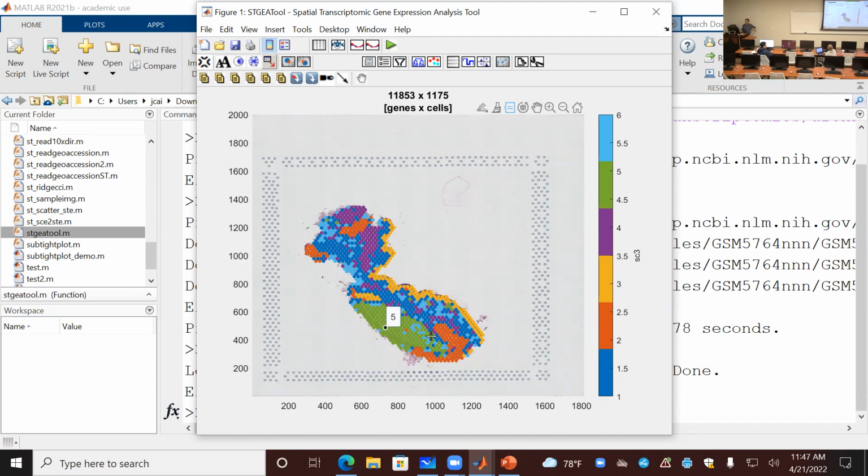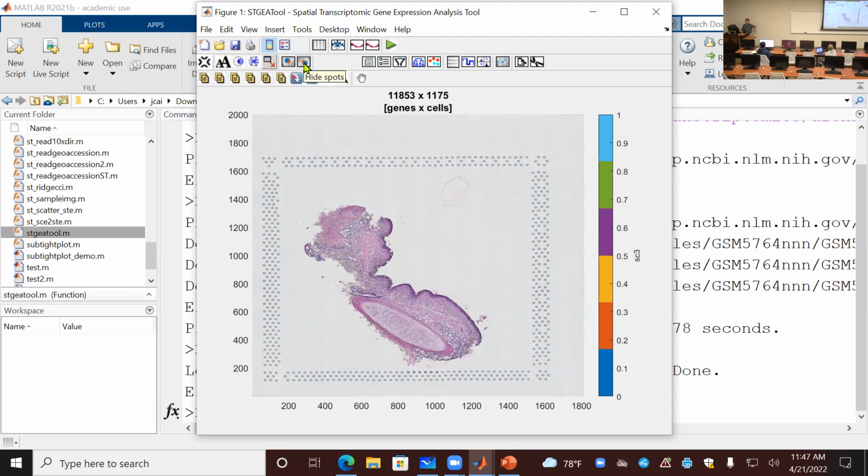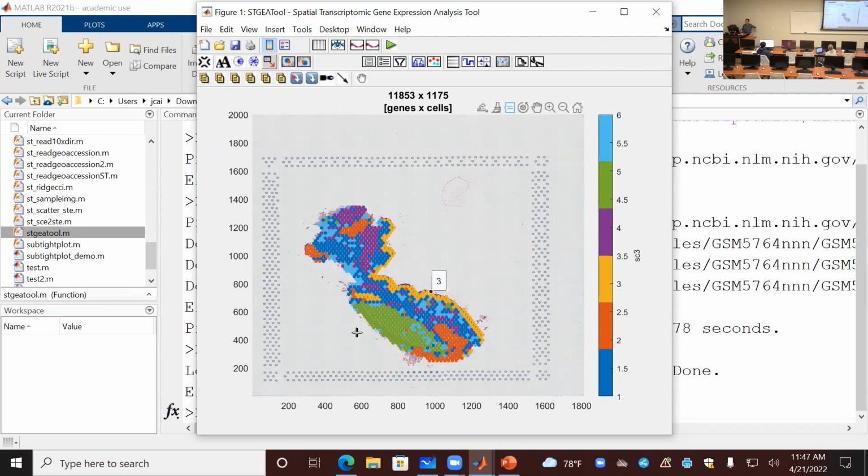And then this yellow one on the edges here is classified as a different group. So you can see that underneath, this image has a strong structure compared to the one I just used as an example. But this one is a more heterogeneous sample, and there are different clusters.